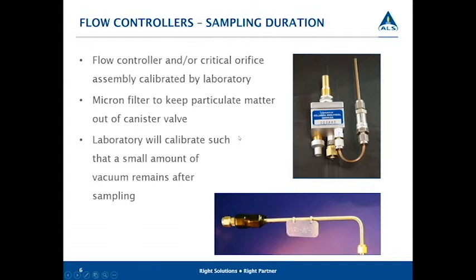Does the micron filter keep out water as well, Mark? No. So if you suspect moisture, there are different filters that can filter out moisture as well.